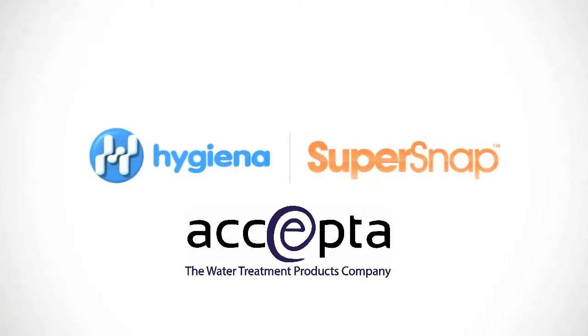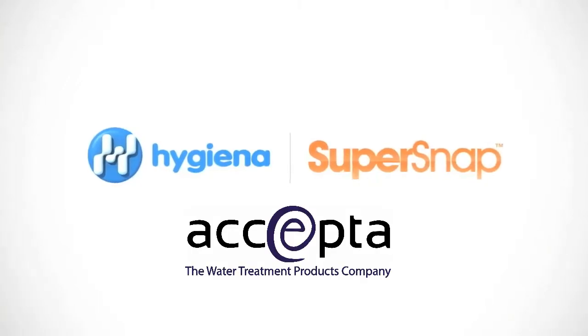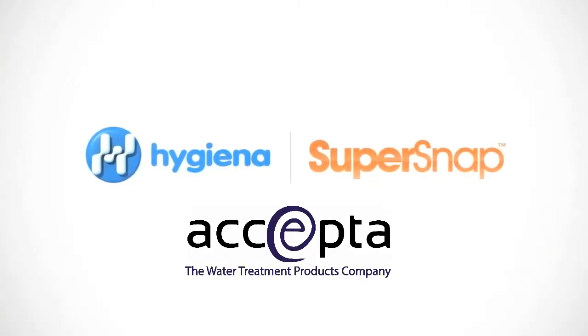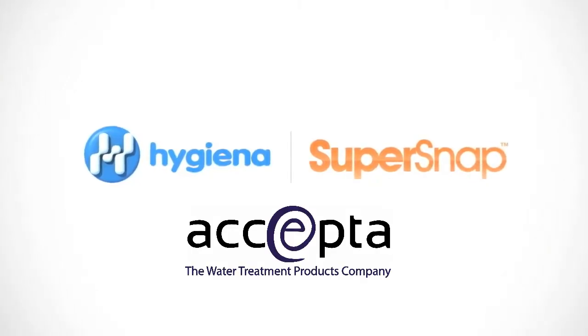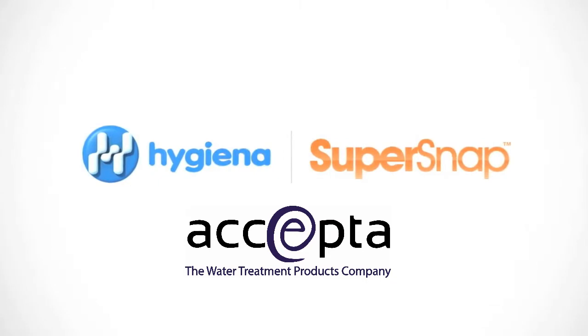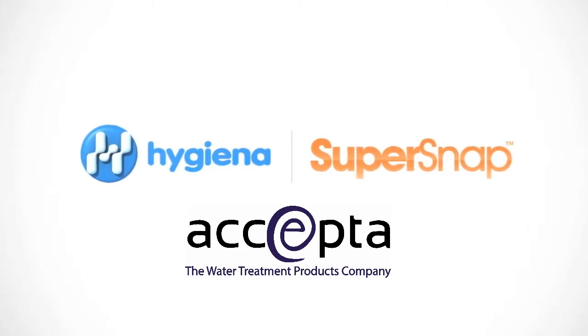This instructional video will demonstrate the proper use of SuperSnap, Hygiena's high-sensitivity ATP test.